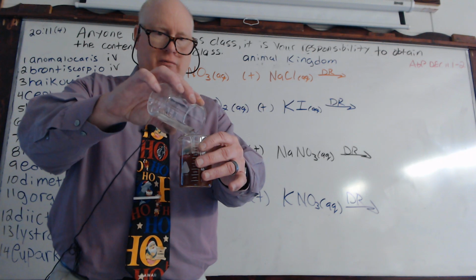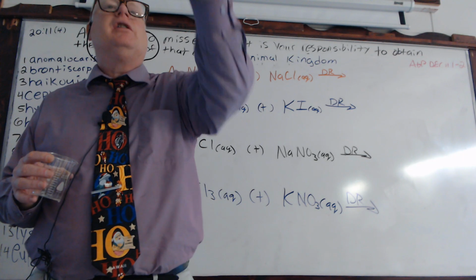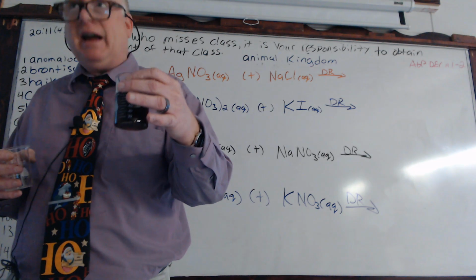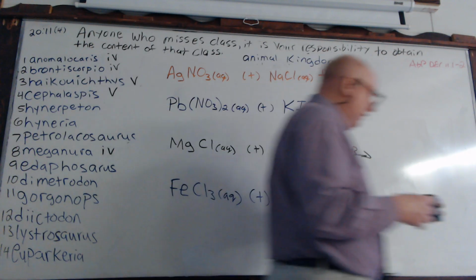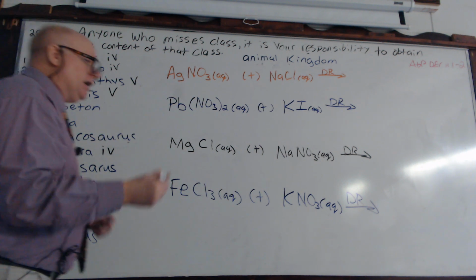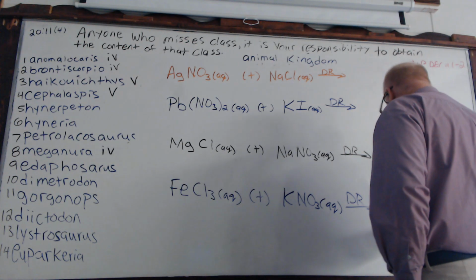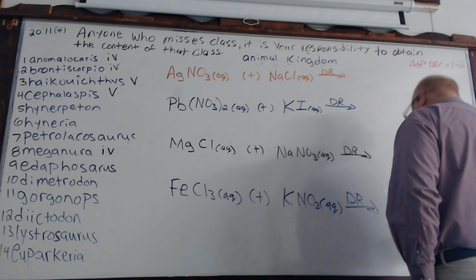We just have, maybe you could say there's a slight color change, but nothing really dropped out of here. It's just maybe magnifying the color change that was already there, but that's not a chemical reaction. So what we could say is, yes, this is actually continuing to move forward, you might think. We could put a reaction on this side, saying this must be taking place, because for balancing purposes, we've got this iron, and then we've got nitrate. Remember, the charges will not change.